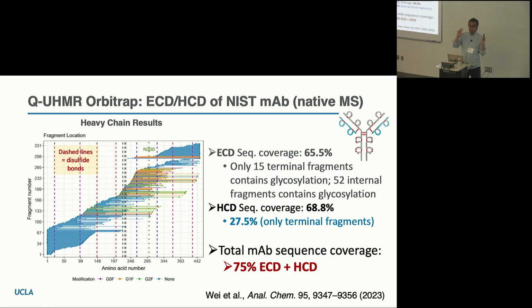That has kind of died off right now just because it was very hard to reproduce. There's something still intriguing in there fundamentally, that they're getting sizes of complexes this way, but it never caught on, as MALDI didn't catch on. Well, MALDI's almost dead, other than imaging and some of these other methods. So if anybody wants to get back into MALDI, that would be a method to look at.